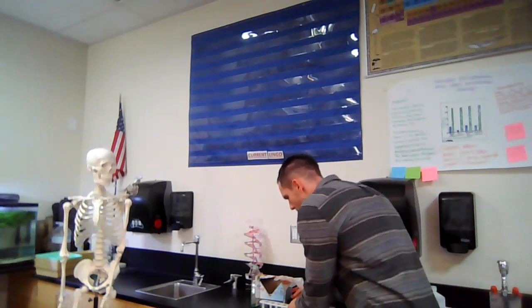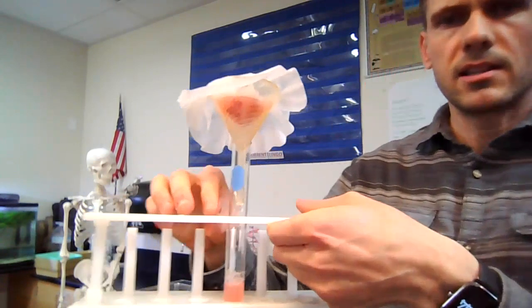All right, so we're just going to let that sit there. I'm going to take the baggie. Hopefully all the solid chunks are out now. I'm just going to open up the baggie, and very carefully pour this into your little bowl you made, your little filtration device. Go slowly so it doesn't spill over. Hopefully you'll see it start to drip into the test tube. Mine's actually going kind of fast. All right, so I can see it dripping into there.